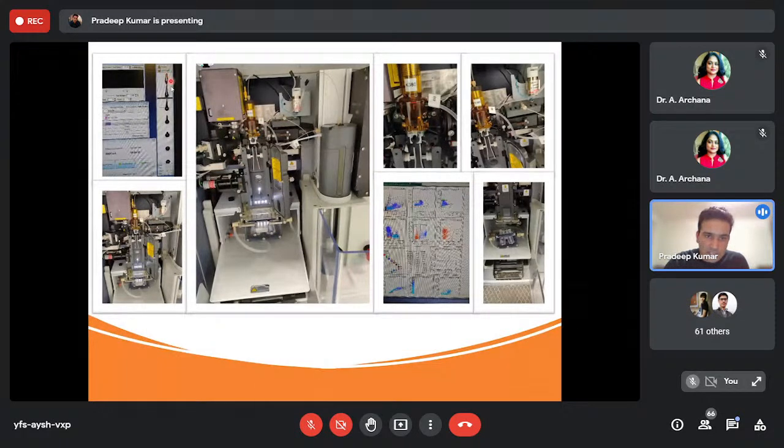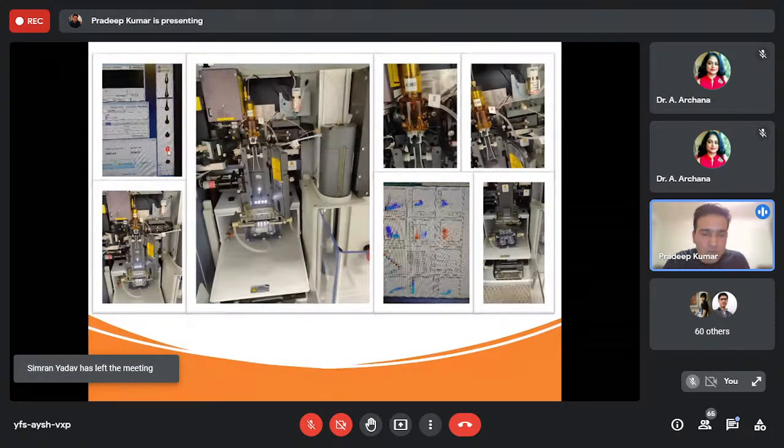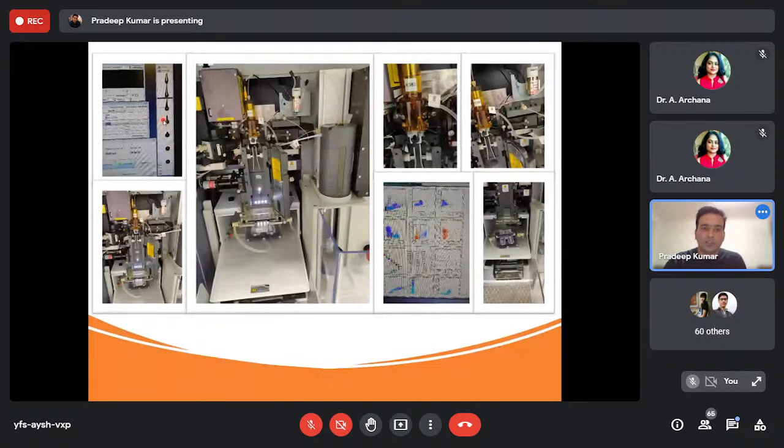Until this point the stream was continuous, but because we have vibrated it so much, it starts forming individual drops, and these individual drops may or may not carry your cell of interest. The white thing between drops is not a cell, it's just the image, so don't confuse it with a cell. These individual drops then go in front of high voltage deflection plates, and based on the charge, positive and negative, they are sorted to the left or to the right. This is the center stream, where the continuous stream goes into waste.